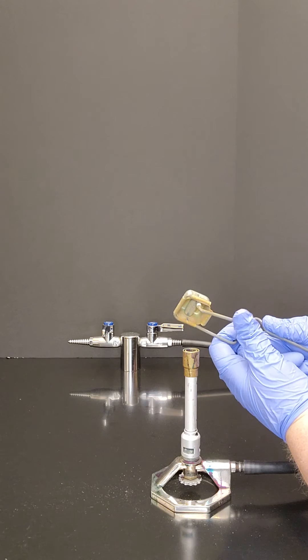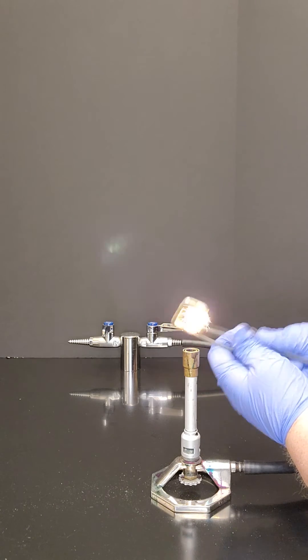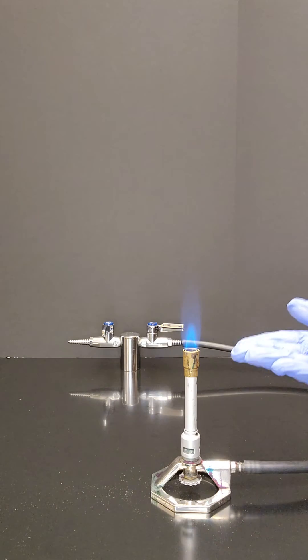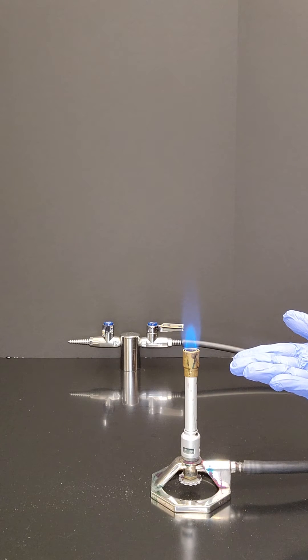Give the flint some good downward pressure and this is the kind of flame you should see when you light your burner.